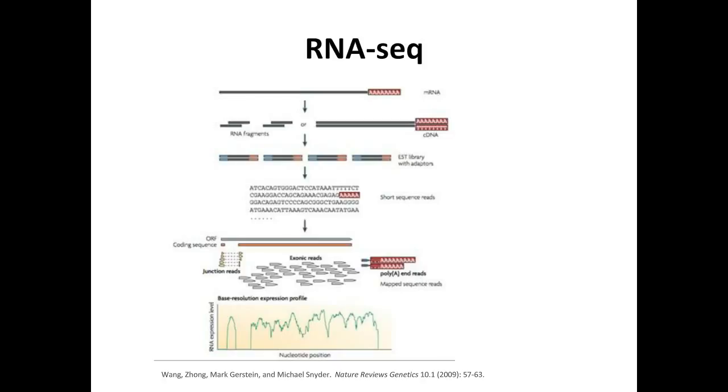After sequencing all these samples, you need to map the reads back to a reference genome. For most species of interest, a reference genome is available. So we can map these sequence reads to the reference genome, and based on the number of reads that map to each gene, you can quantify how much of that gene is expressed. This is a typical RNA-seq experiment, which is used by us and most labs studying RNA sequencing.